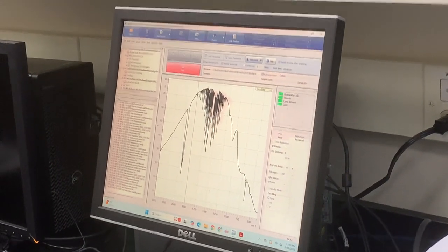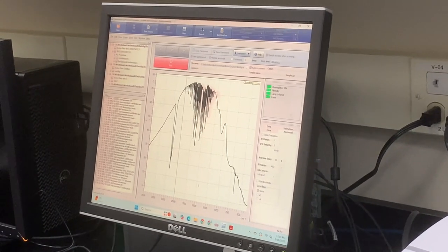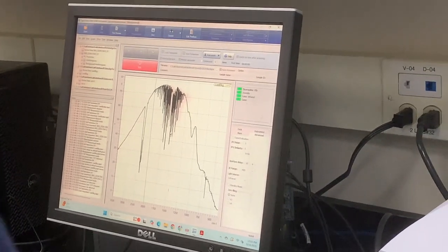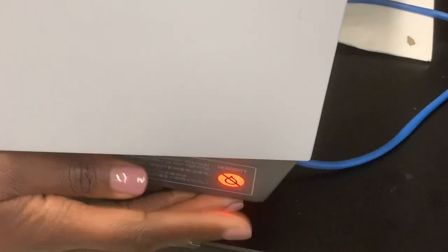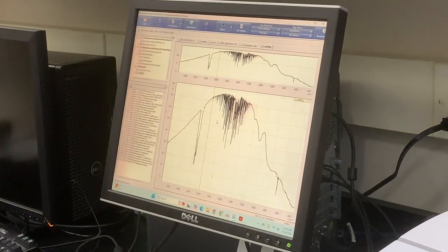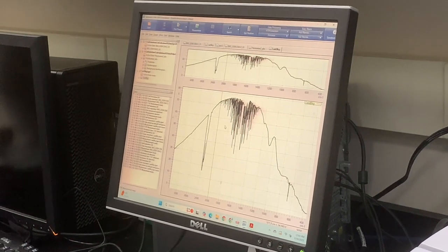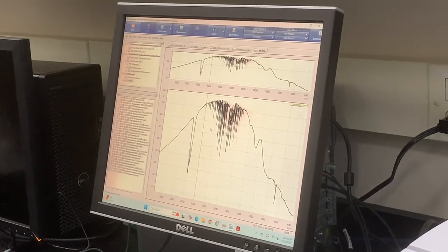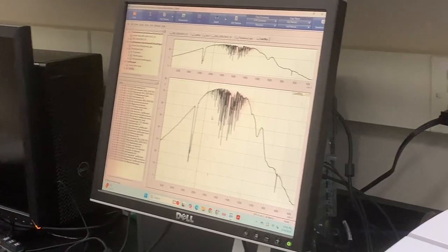So whenever you're going out of the software, there's a good chance that you'll see this caution sign. Do not be afraid. It's just telling you that the light needs to be on for the instrument. This orange light needs to be on to make sure that the dehumidifier is working. Please, if that orange light is not on, call us immediately, because if there's humidity getting into the instrument, it can cloud the optics. And we can't clean the optics. We would just have to replace the entire optic.